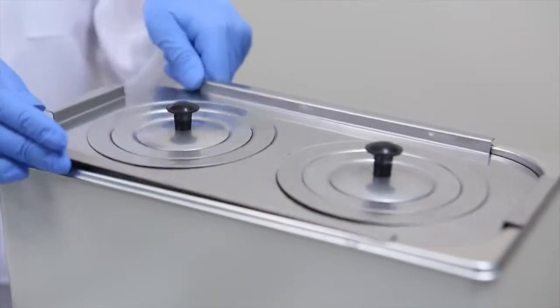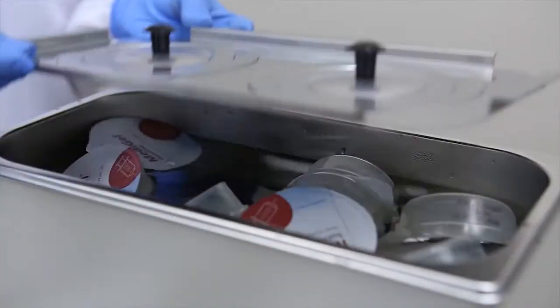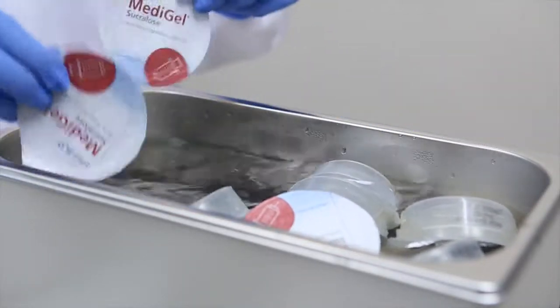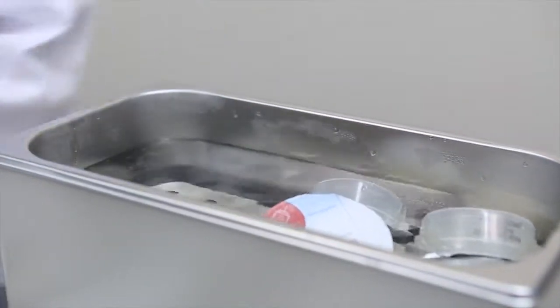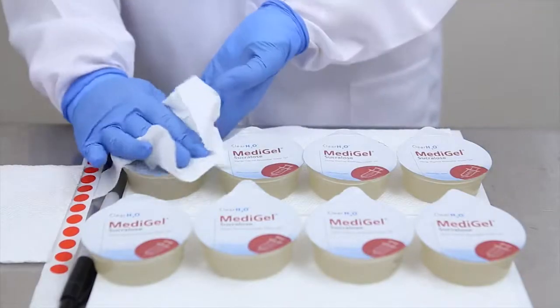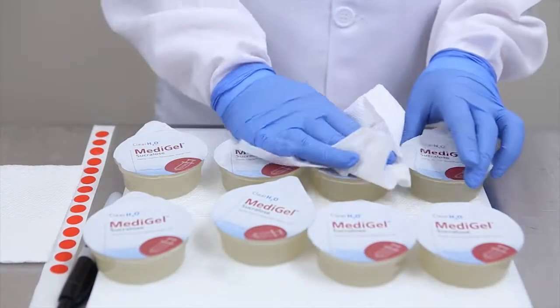The first step is to place all eight cups into a hot water bath at 60 degrees Celsius. After 15 minutes, Metagel sucralose will be completely liquefied. You can now remove the cups from the water bath and dry them in preparation for adding the desired medication.